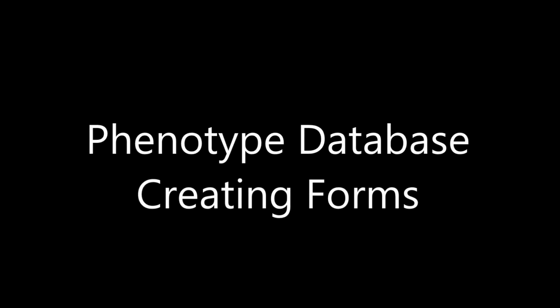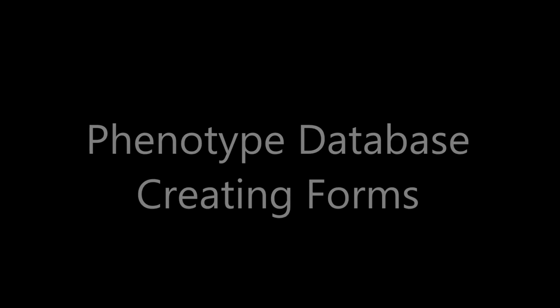Welcome to the Phenotype Database. In this video, I'll show users how to create forms for capturing phenotype information.